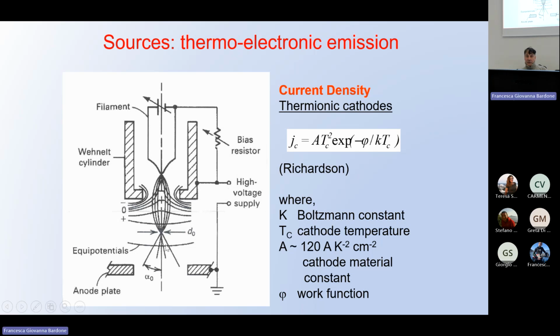Here, the first image, the first crossover of the electrons which are produced here. Then this crossover, this point, is demagnified over the specimen surface. Advantage: very, very low cost. Disadvantage: not good spatial and energetic resolution.